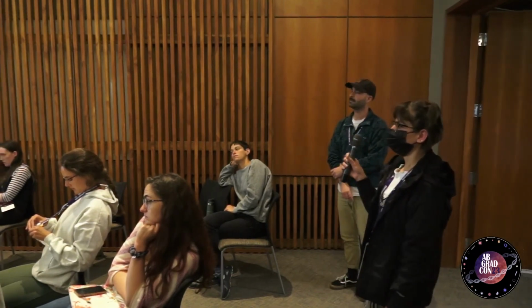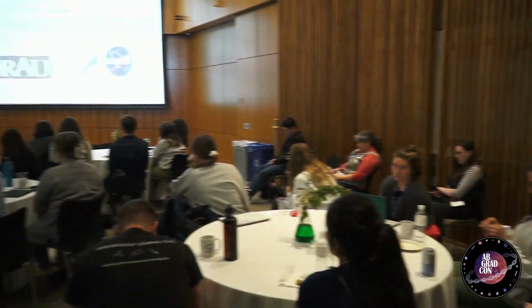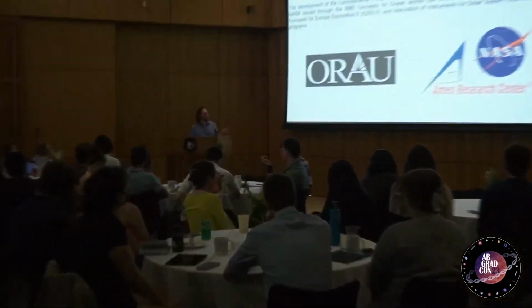Yeah, so that's a great question, and the goal here is to pick up as many different breadcrumbs as we can to try and differentiate. And so you mentioned stains for genetic material. One of the stains that we would be launching with this is a stain for nucleic acids. Now, obviously, that would be really awesome if we found DNA on Europa or Enceladus, but it's an open question whether we would.